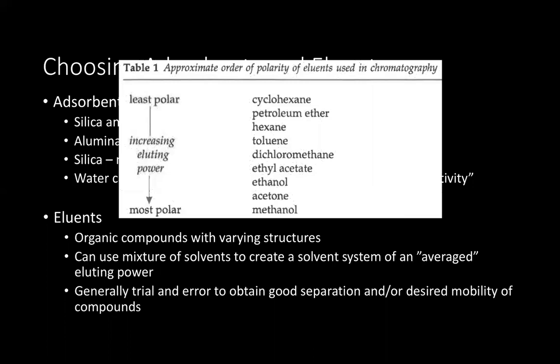In terms of eluents, you have the table on this slide in your lab book, reminding us of polarities of organic solvents. Eluents for TLC will always be some kind of organic solvents. And of course, they can vary with structures on this list. We see everything from a cycloalkane, alcohols, alkyl halides, ketones, lots of different functional groups.